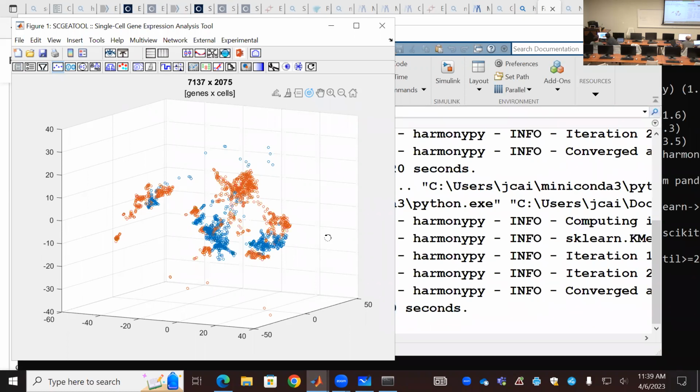Yeah, the data set is not exactly the one. But it's working, right? Yeah. But the data is not exactly the same, it's different from what I get. But you look, you get a better result. You have a complete one. You just run once and you get this. Okay, good. It's good. I don't know.